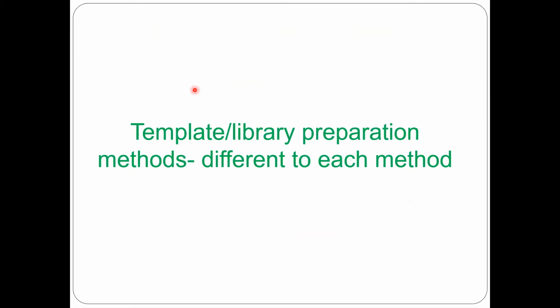So for pyrosequencing, you need to first prepare a library.